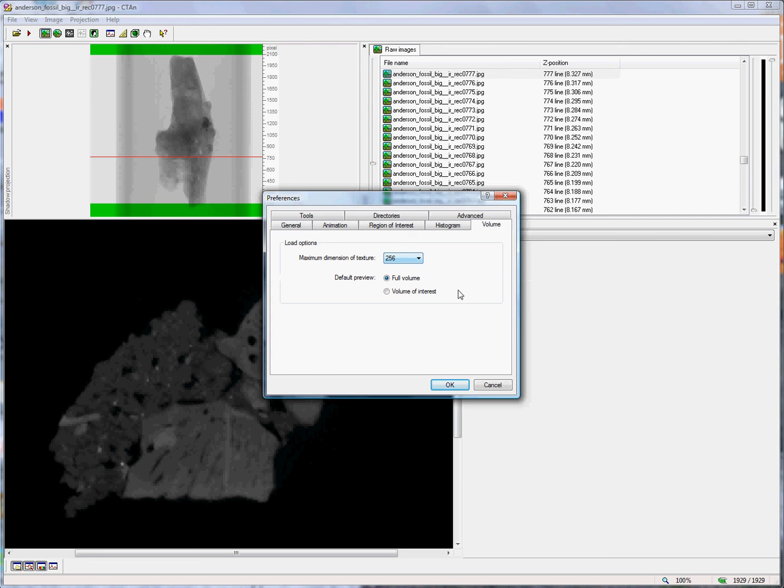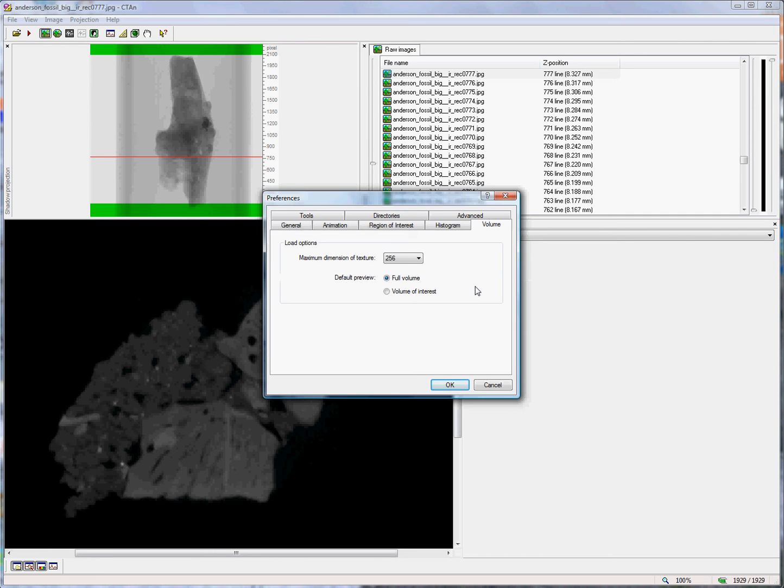This will depend on the video graphics card inside your computer. The bigger it is, the more memory it has, and the more resolution you will have available. In some cases, volume modeling may be completely unavailable if the graphics card does not support OpenGL 2.